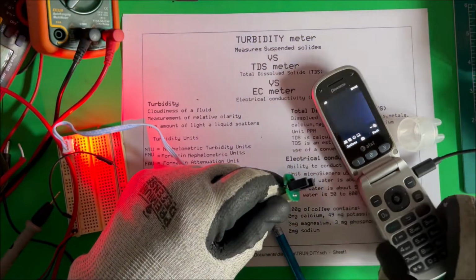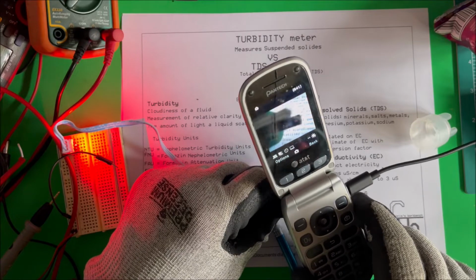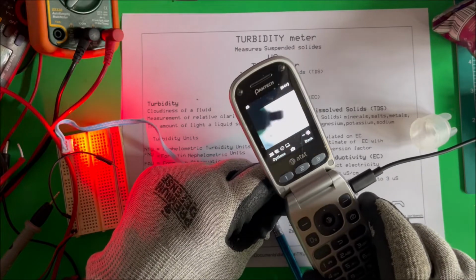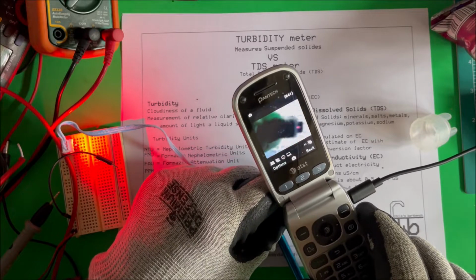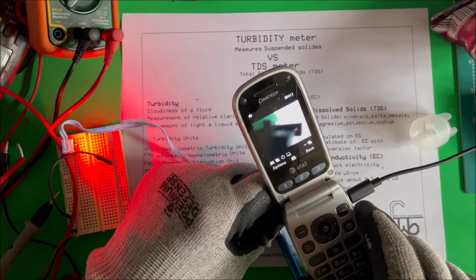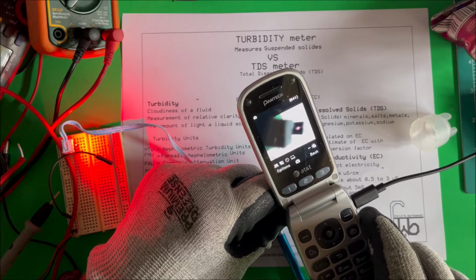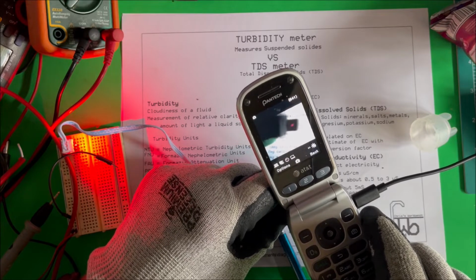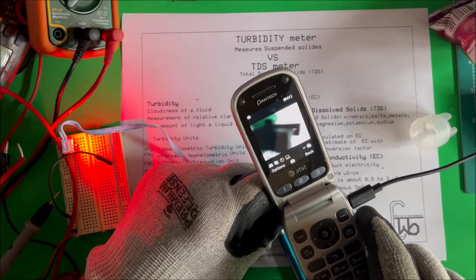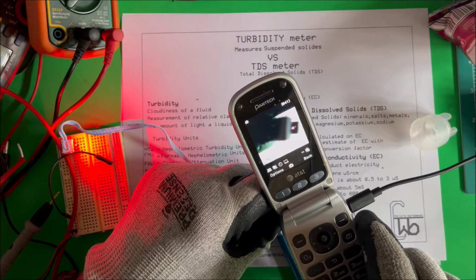There we go. You can hold that in the right spot. There we go. That's an infrared LED there. I have to hold it just right. There we go. That's an infrared LED.